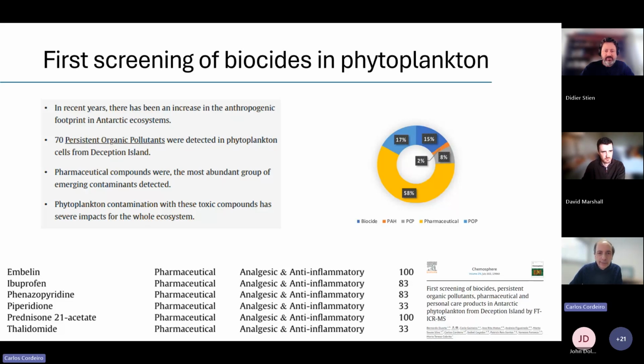So then we went on to the next step. And what was our next step? Our next step is what kind of effects do these compounds actually have on this kind of organisms? And for that, we use two approaches. I'm just going to talk about one of them. You can have fishes in the aquarium and just throw in the substance you want to analyze. You can do it with fish cells in culture, which I think is probably the best model. So you can actually use hepatocytes from fish and test this, or you can actually do this with phytoplankton.